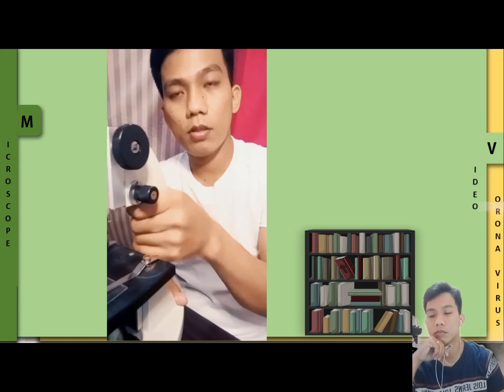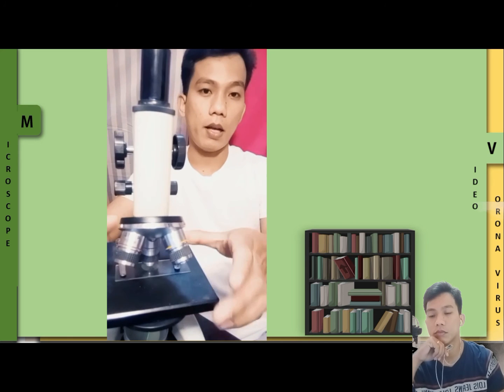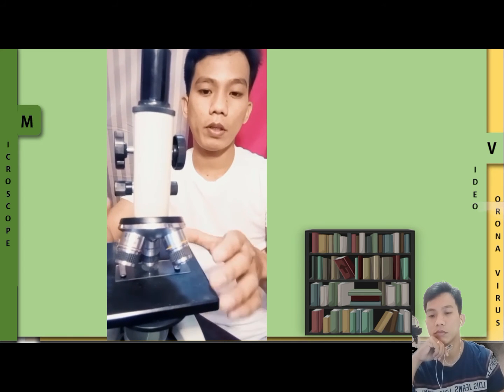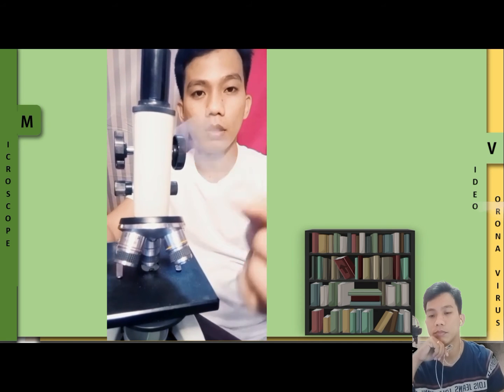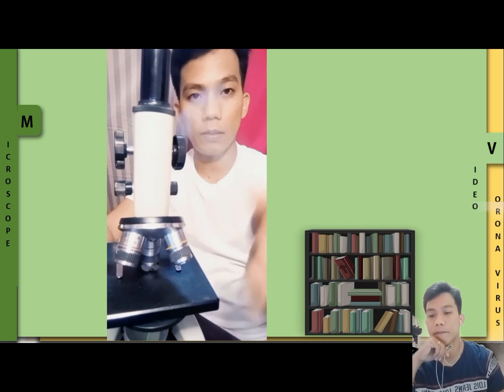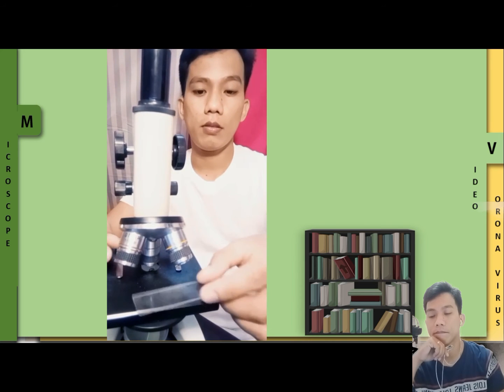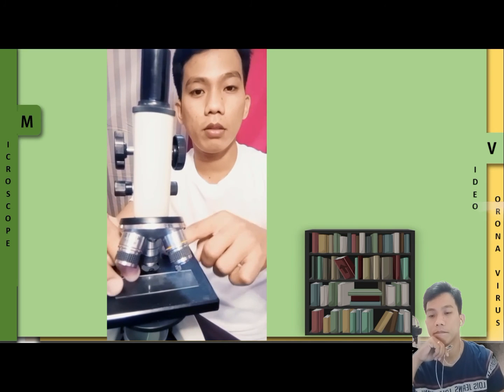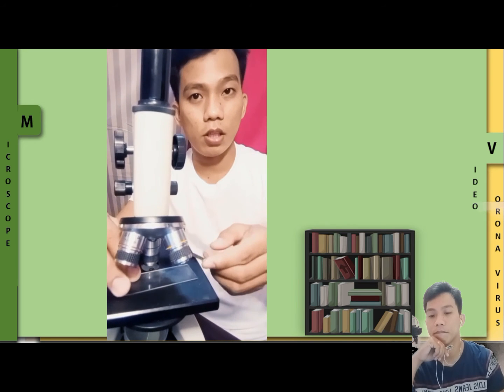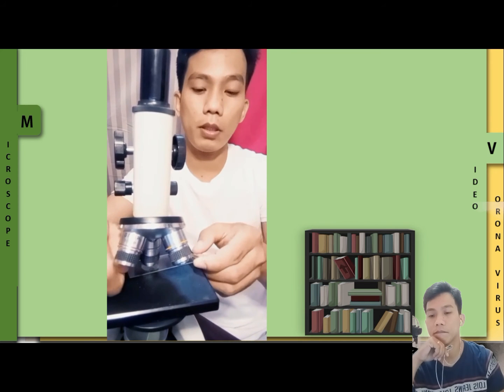Next is your stage. Your stage is this block here. Okay? Yung stage natin, dyan nakalagay yung tinatawag nating slide. Dito lalagay yung mga specimen na titingnan natin. And, since may slide tayo, gagamitin natin yung tinatawag na stage clip.